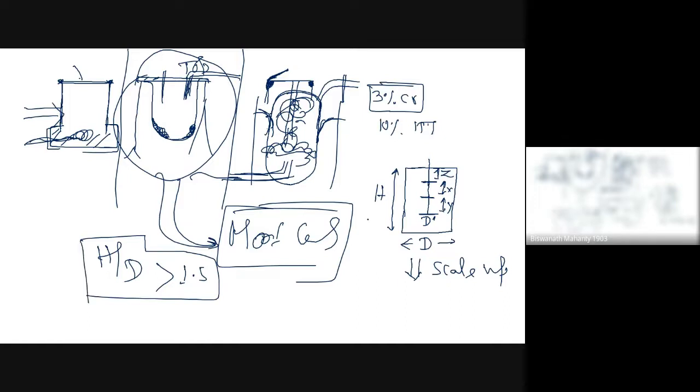Okay, are you getting the point I am talking about? Most of the time industrial fermentation follows some reference number, the height to diameter ratio, for example. Similarly, I can say impeller diameter to main diameter, D prime by D, can be around 0.25 to 0.5 normally.